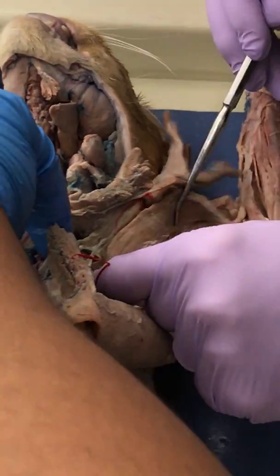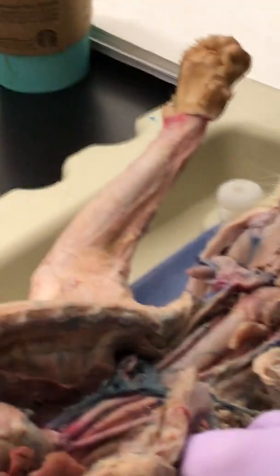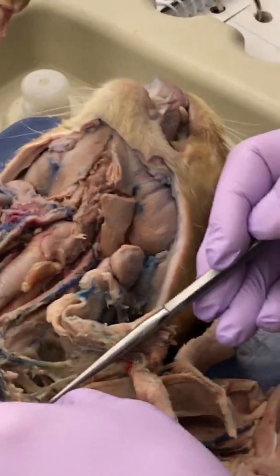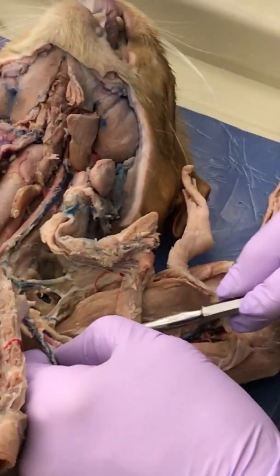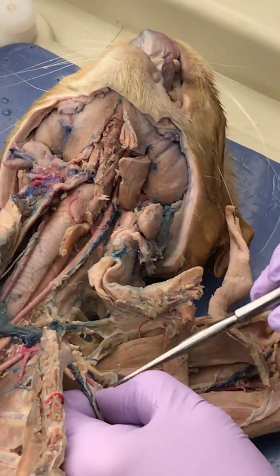Is that one subscapular? Well, it's got to go down. Yeah, better be right there. Just go that way. Got gloves on. Okay, Casey, come look from this view. See, that's what I was saying. It's because it's big on this cat. Subscapular artery.